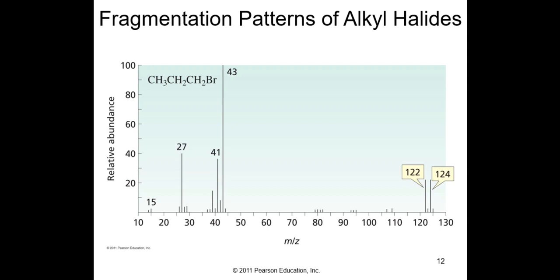If you see twin peaks in a court of law and you have an illegal drug containing bromine, they're going to settle out of court, because the DA is going to bring in a forensic chemist, and the forensic chemist is going to say this compound, a controlled substance, is known to have a bromine, there it is. There's the mass spectrum of the sample that was confiscated. So that's why right away they settle out of court, because as soon as the judge sees that, it's over.